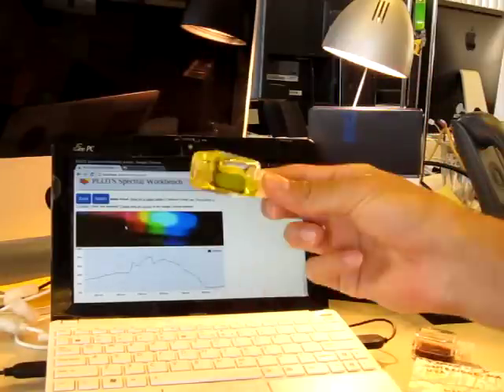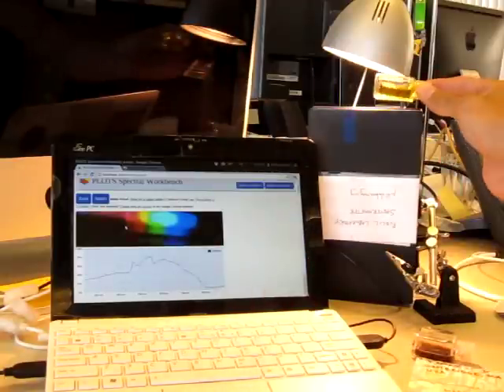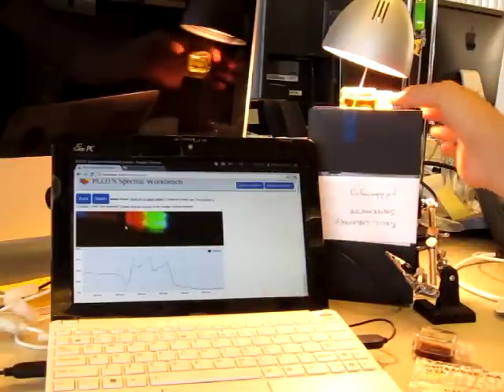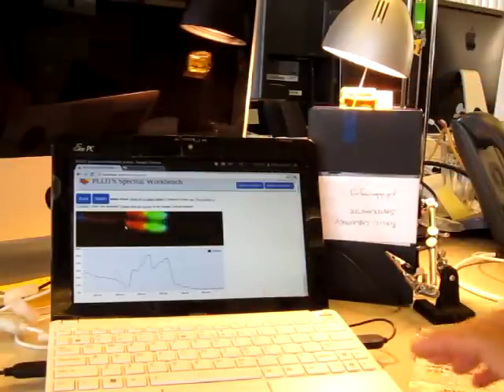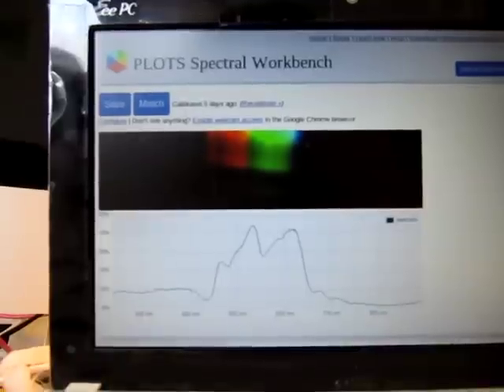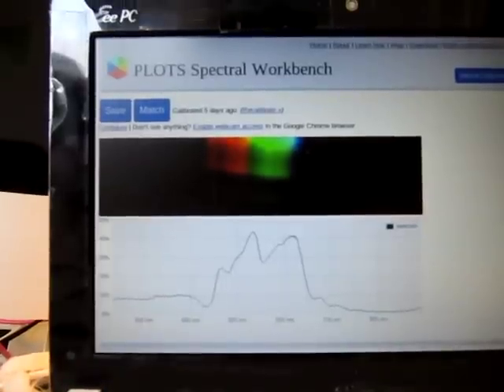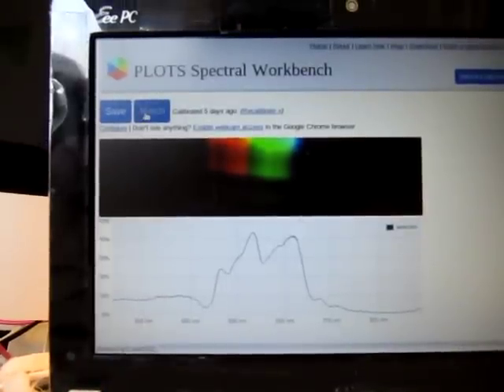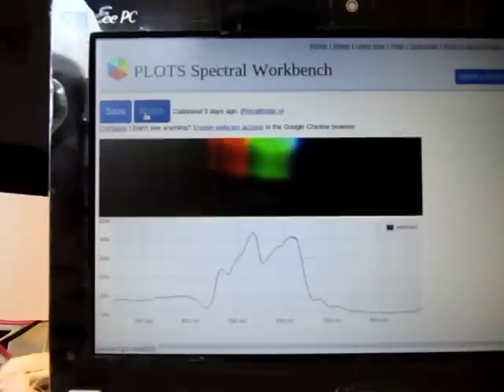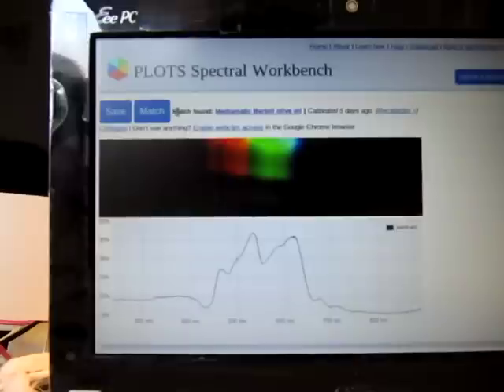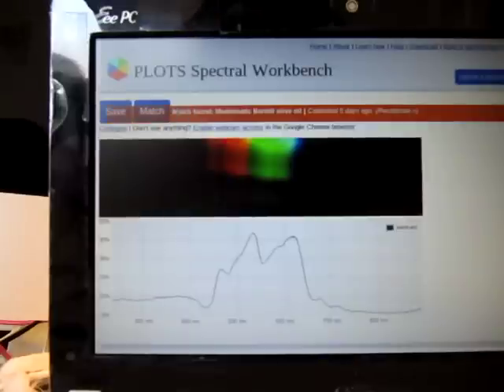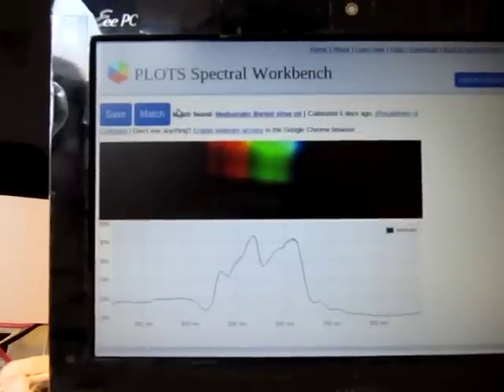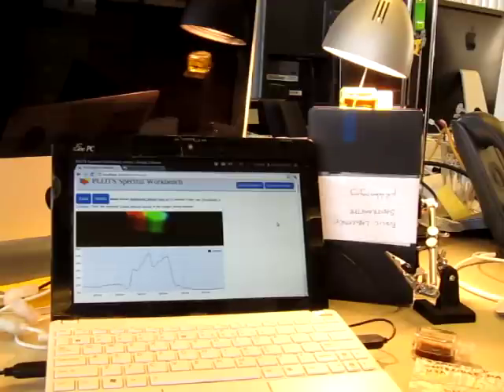And just to show, I'll put the other one, the Bertolli, in here. Give it a second to calm down. Match it. And it says Bertolli olive oil. So we have basic spectrum matching already working. Thank you so much for joining me.